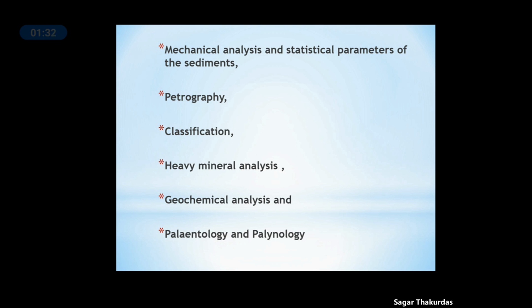After that, heavy mineral analysis, where we identify these heavy minerals, and the identification of these heavy minerals can be useful in identifying the provenance, the source rock of these sediments. Then there are geochemical methods, which involve geochemistry, like finding the total organic carbon in case of shales, or use of a flame photometer. So there are a large number of geochemical methods which can be applied based on the desired results.